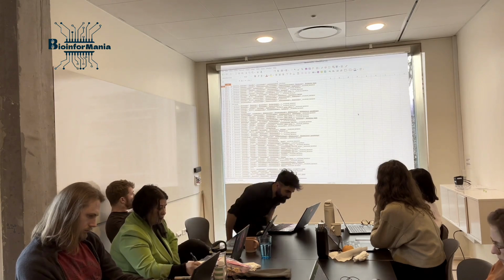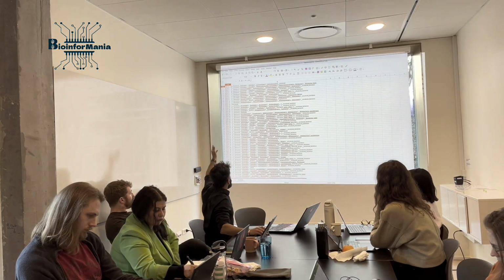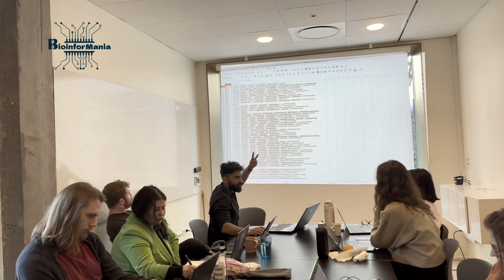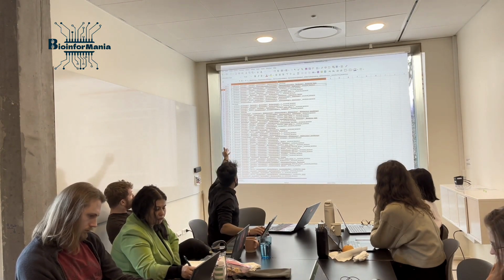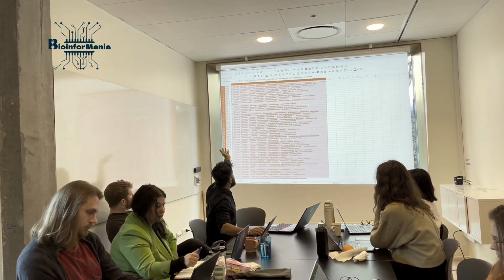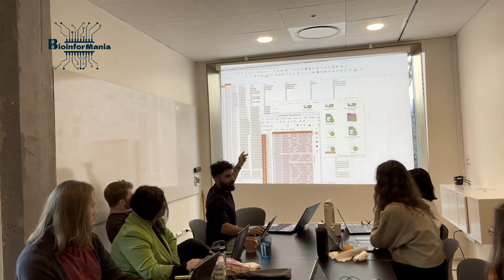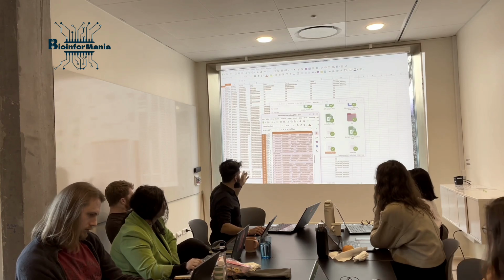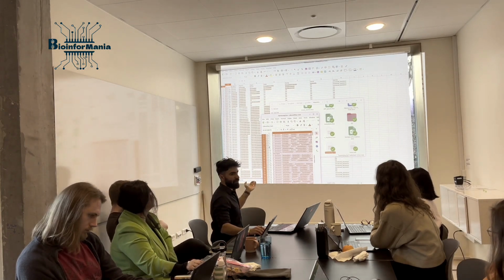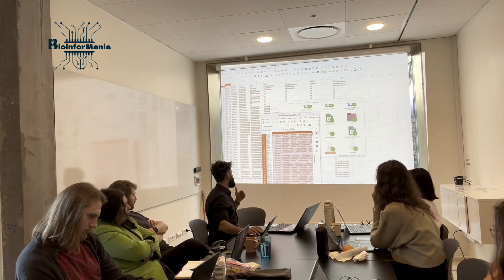When you have unparsed data, you should not have a header, okay? We don't have a header. You only have two columns. This column and this column. If you want to parse your data yourself, you could do it, but why would you do it when the app can do it? So usually our output is unparsed. It needs to be only two columns: one column your unparsed taxonomy name, and the other one the OTU table. Sometimes it has a header, sometimes it doesn't.